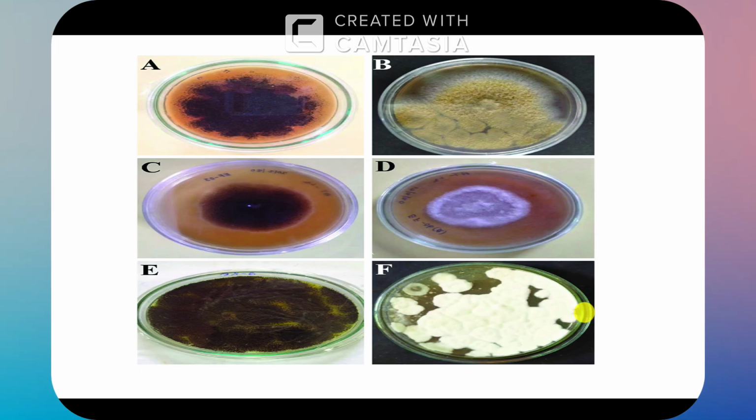These are some types of fungi which are isolated on the media. The main general and specific media for fungi is SDA, if you remember. We talked about and explained SDA, Sabouraud agar, and we have more than this, but this is the one we have worked with, of course.